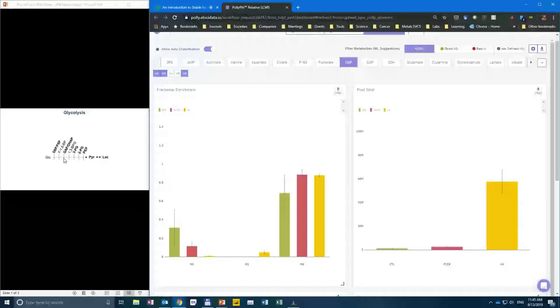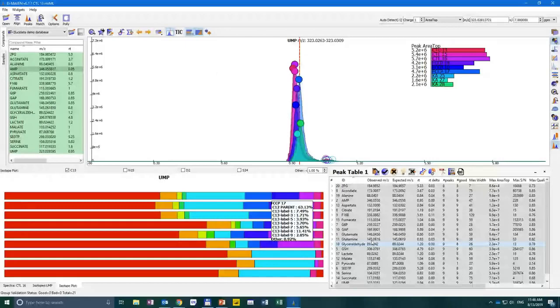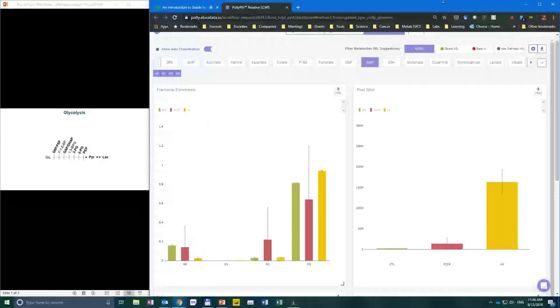Now going down, let's move to 3-carbon metabolite, the GAP. And we see that once we click on any of those metabolites, everything refreshes almost on the fly. Please note that in the FCCP group, we have a large standard deviation, large error, and that's due to the fact that one of the metabolites was missing. And I'm just going to quickly show it to you here. Going back to L-Maven, you see that there's something wrong in this particular FCCP14 sample, and that pretty much shows here in our plot.